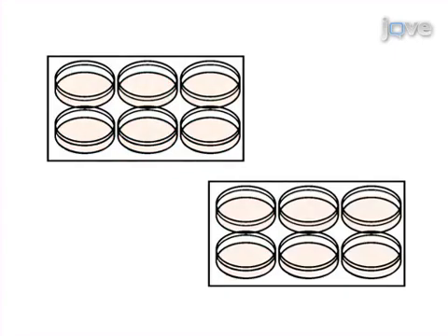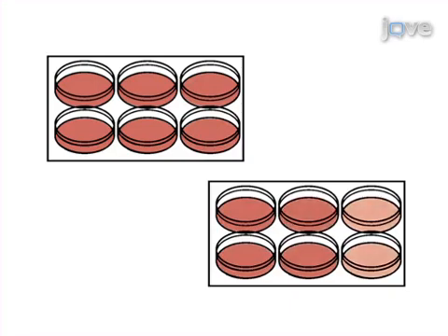Next, aspirate the inoculum and overlay with a 1 to 1 ratio of C-plac agarose and 2x MEM, and incubate the plates for 48 hours in a tissue culture incubator. The final step is to overlay with neutral red staining solution and incubate the plates for one to three hours in a tissue culture incubator.